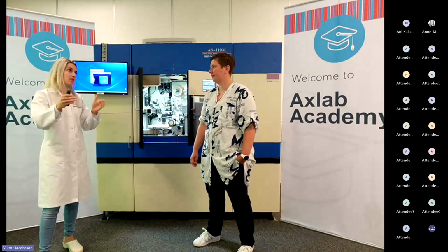So if we took a manual microtome and set it to 2, 1.5, depending on what we would like to section, it's a matter of how long could you have that section throughout all your sections. And with the AS, that is actually more accurate. So if you're thinking your section 1.5, 2, it might be even higher. And this is what we're seeing. The average of the thickness from manual is actually higher than what the set count is. And this is a touchy one, but this is just what we have been seeing.